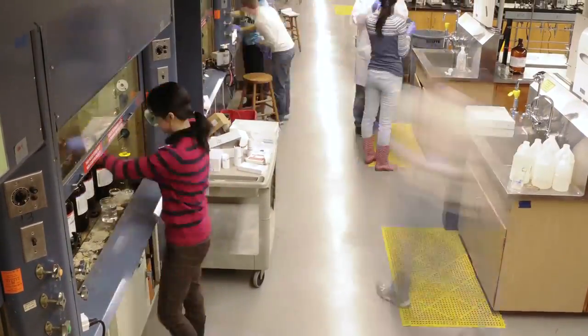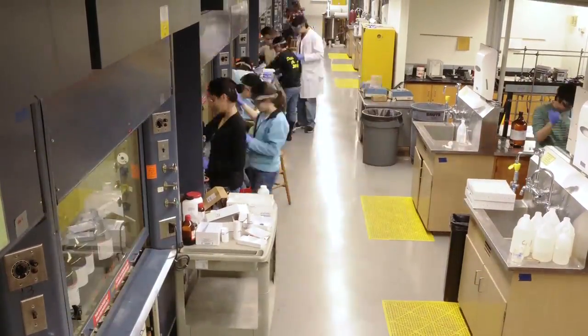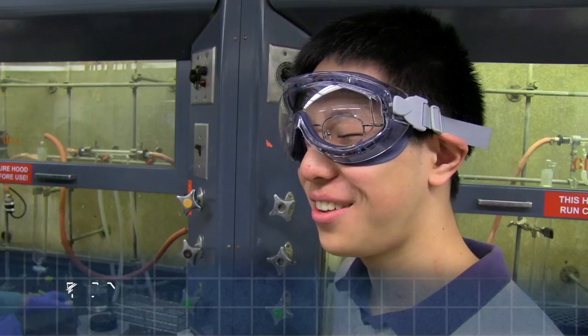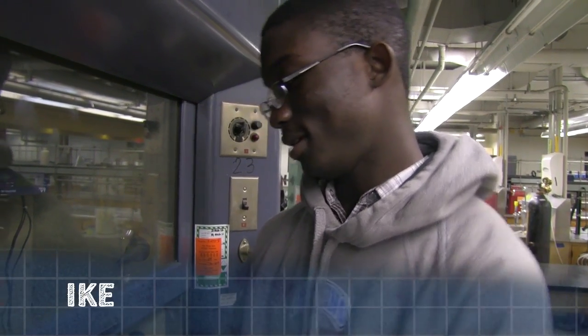And so it begins. But packing and running a column is not easy. Ideally for this experiment, you would have one mentor mentoring each student. I'm so nervous for this. He made me feel like this lab is much more difficult. Hopefully it's not as bad as they say it would be.